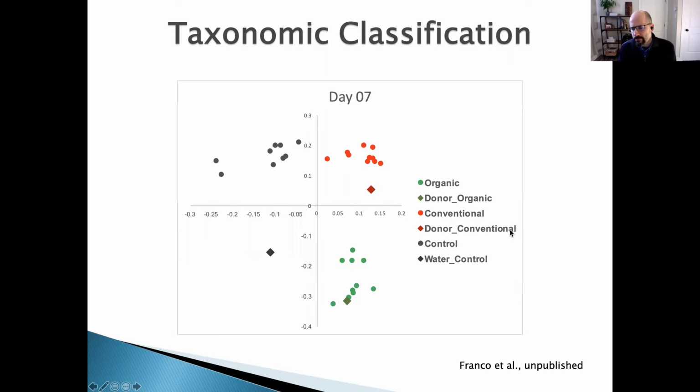And what type of plot is this one, Sarah? It's a PCoA. PCoA, very good, very good.